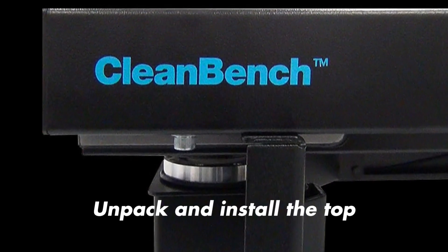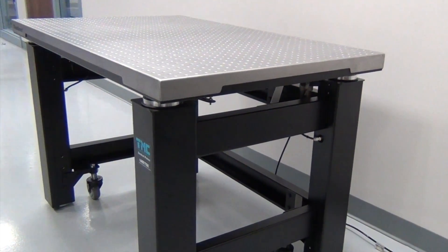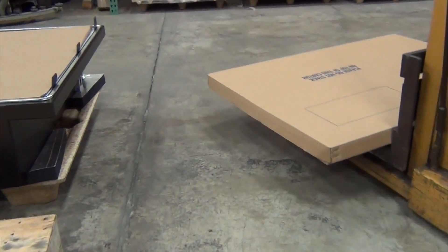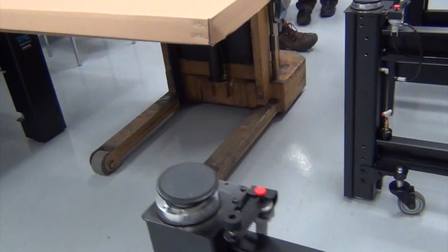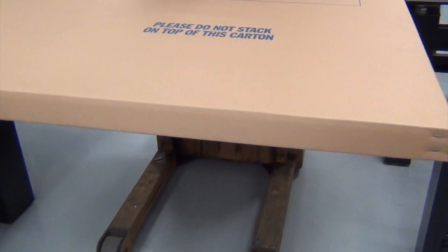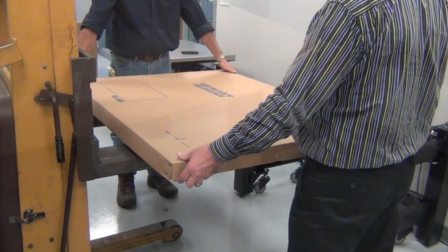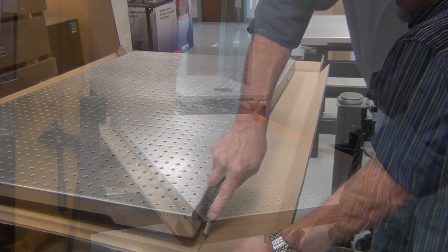Now you are ready to install the top onto the legs. For a clean bench with tapped holes, the top is packaged separately. If you are opening a smooth top clean bench, the top would be located inside the same box as the legs. The top should be lifted properly. Here we are using fork tines to lift the top while still in its packaging.